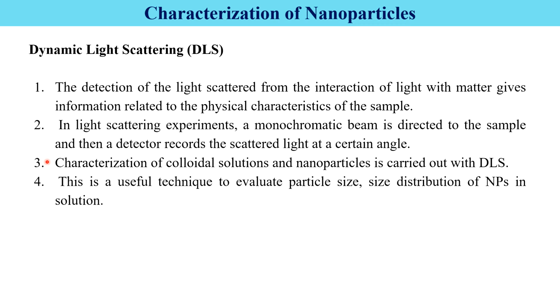Characterization of colloidal solutions and nanoparticles is carried out with DLS. This is a useful technique to evaluate the particle size distribution of nanoparticles in solution. This technique is also useful to detect whether nanoparticles are aggregated or scattered in the solution.